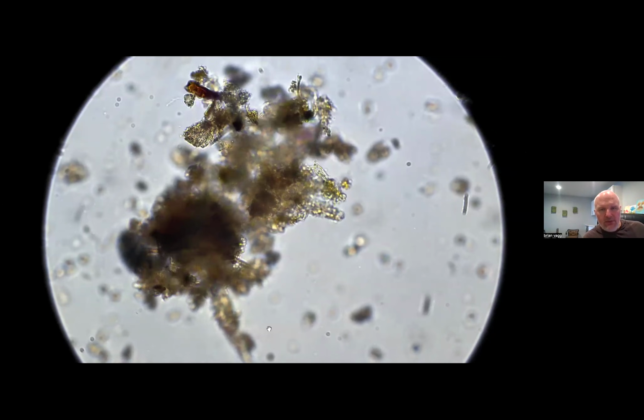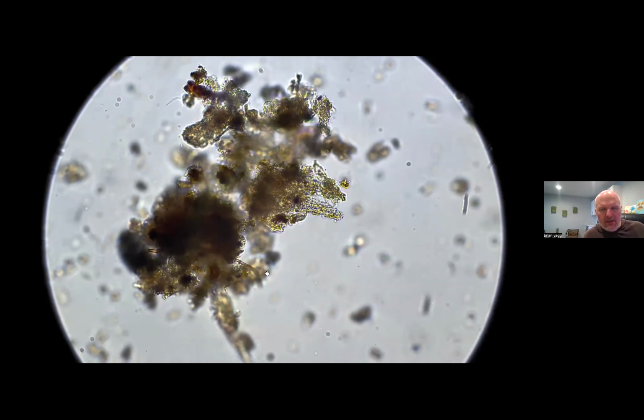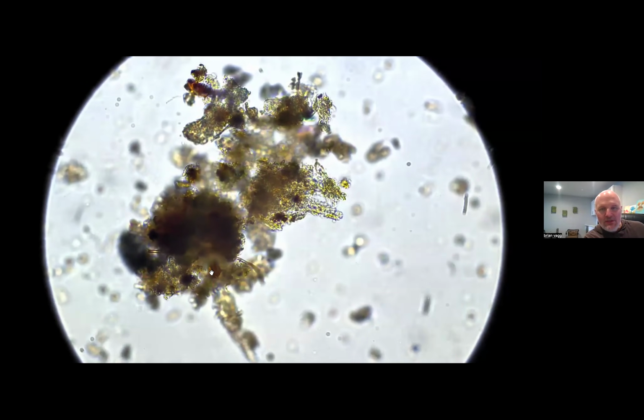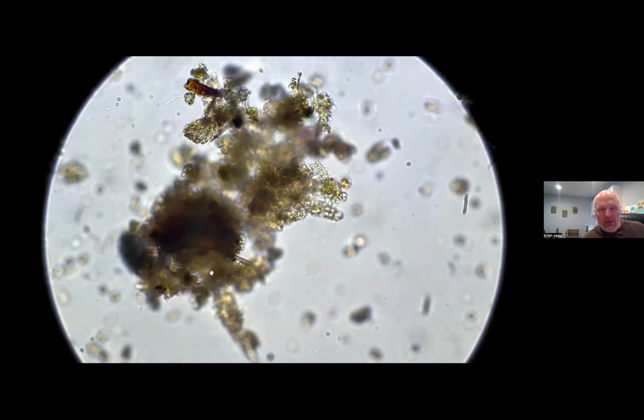But look when I zoom in to this aggregate, and I think you guys can see my cursor, right? So what is that hiding in there? Anybody? It looks like some sort of fungal hyphae. Fungi. And so a couple tricks you can do is you can brighten the light source so you can try to see through that aggregate.